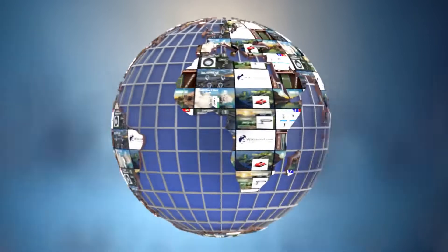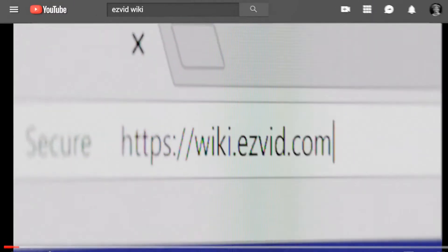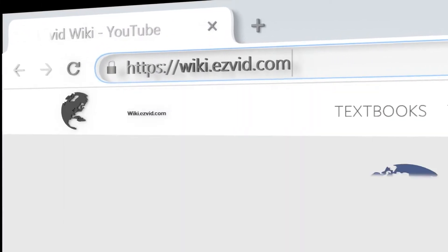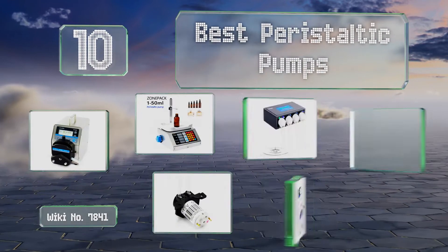EasyVid presents the 10 best peristaltic pumps. Let's get started with the list.